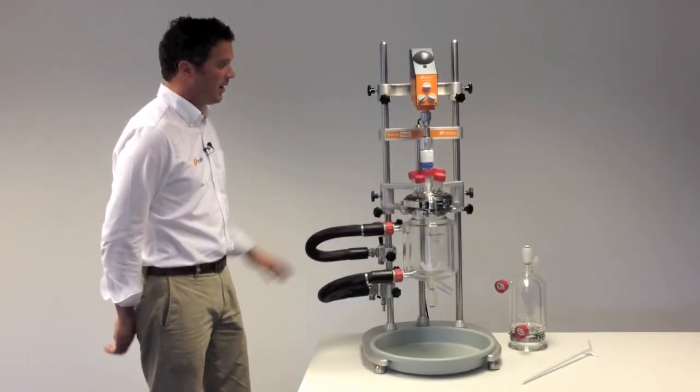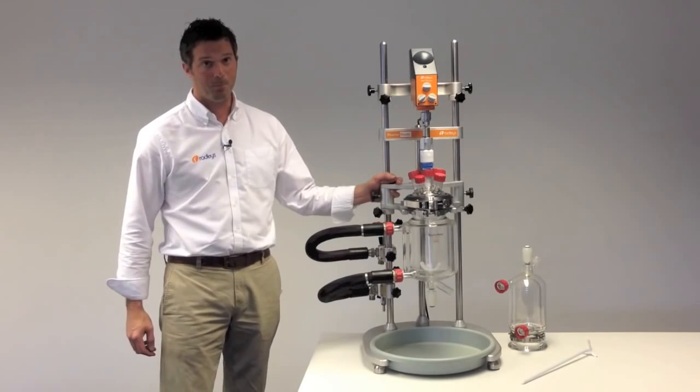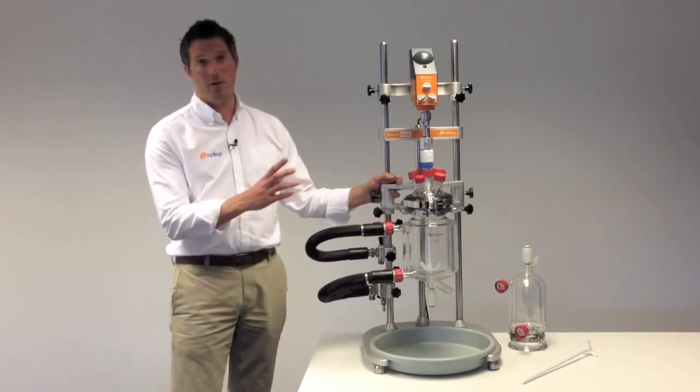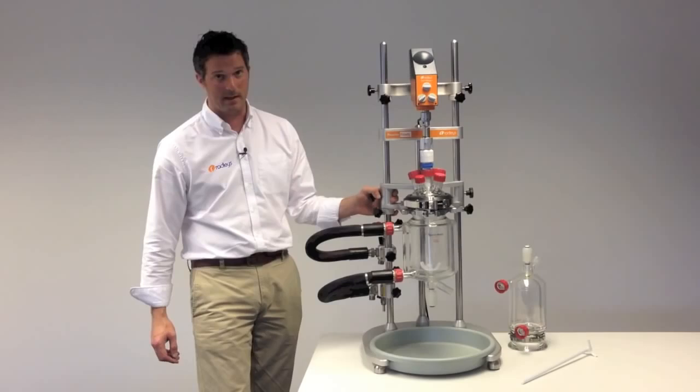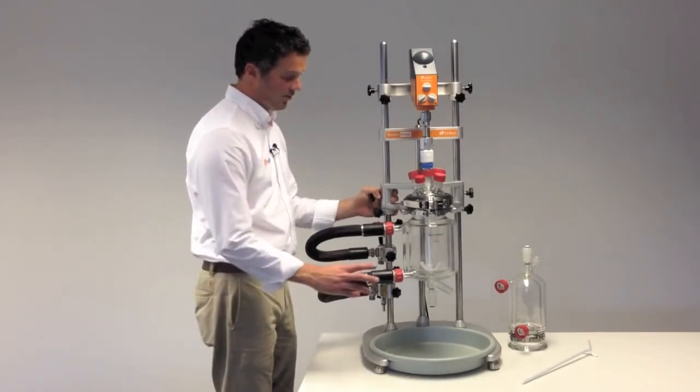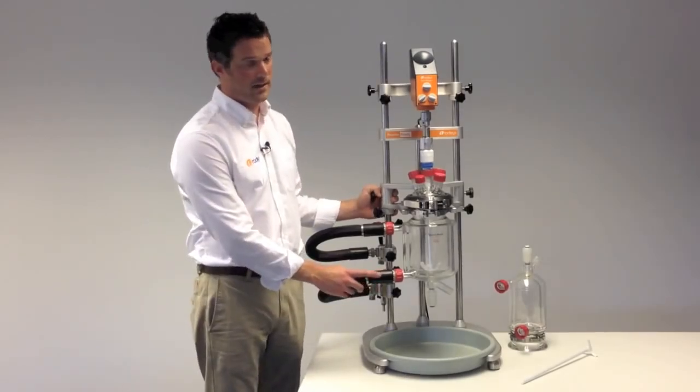Hi, I'm Ben from Radleys. I'd like to show you the Reactor Ready. This is a single universal framework that replaces the need for multiple reactor setups and accepts vessels from 100 milliliters up to 5 liters.